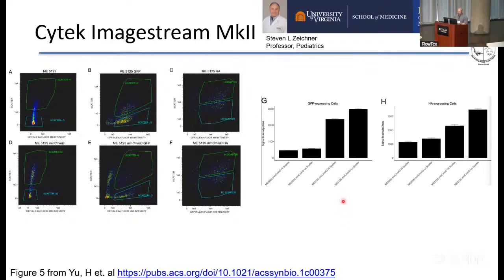And we showed that in the non-genome reduced E. coli versus genome reduced E. coli, the signal intensity is higher both in the mini cells, which are these peaks here on the right, and also the genome reduced peaks here were higher than the non-genome reduced.